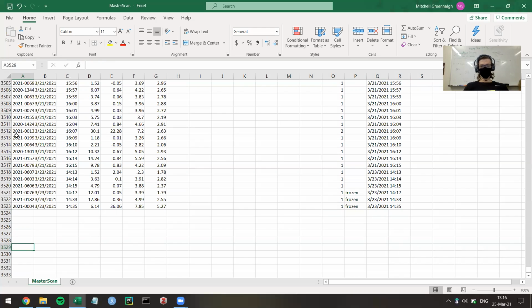So there's two ways to do all of this. In the end, you can either manually type everything out, or you can manually type one or two parts and then do some minor Excel stuff and then copy and paste the rest of the stuff in. When we're doing just small amounts, like anywhere from 1 to 10 samples, it isn't bad to just type in.